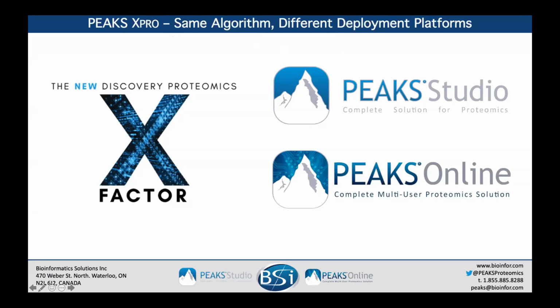And so I wanted to start off by saying that we've spent a lot of time really combining the algorithm of PEAKS Studio and PEAKS Online into one really good algorithm that has the same deployment and is the same algorithm just deployed on different platforms. So we have the PEAKS Studio and the PEAKS Online version.